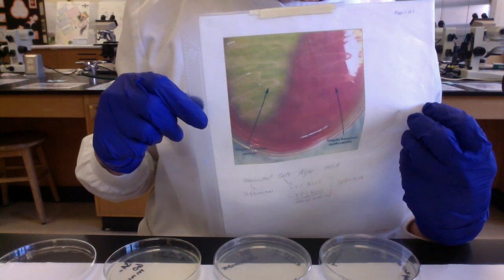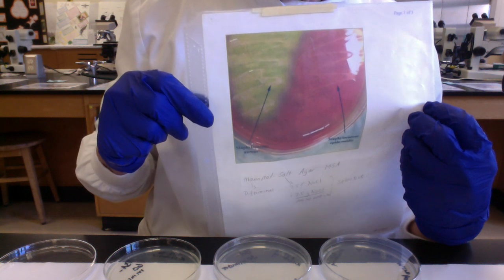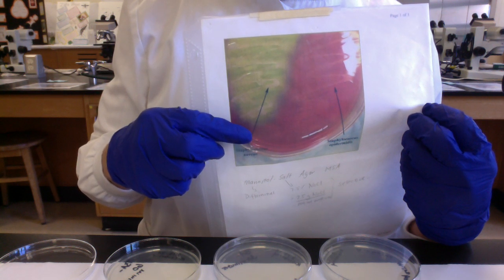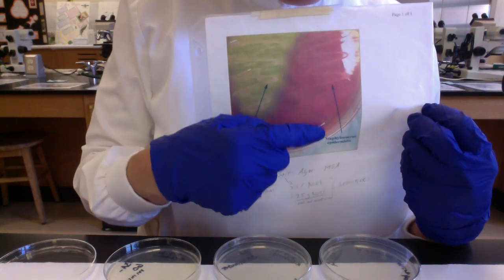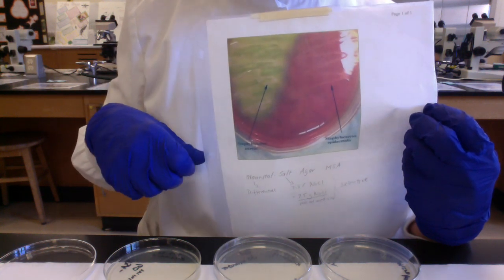The less virulent cousin can also grow in high salt concentrations. So how could we distinguish between them? Well, the way we can distinguish between Staph aureus, which is growing on this side of the MSA plate, and its less aggressive cousin, Staph epidermidis, is based on mannitol fermentation.